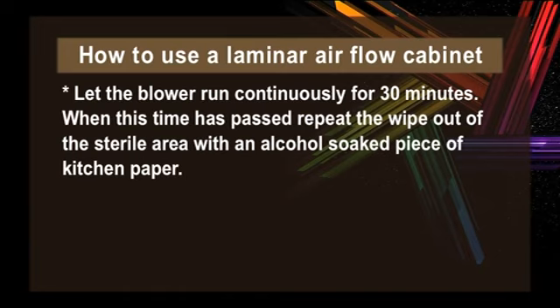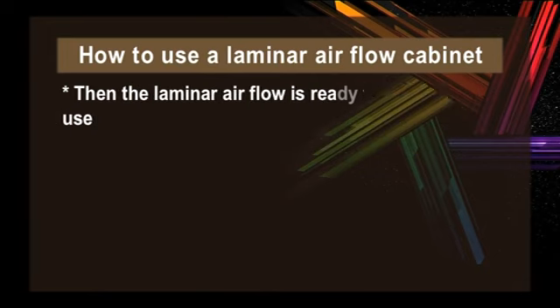Let the blower run continuously for 30 minutes. When this time has passed, repeat the wipe out of the sterile area with an alcohol soaked piece of kitchen paper. Then the laminar airflow is ready for the intended use.